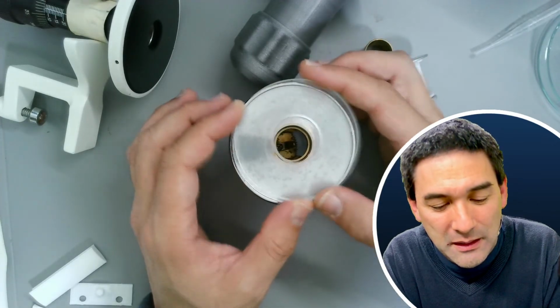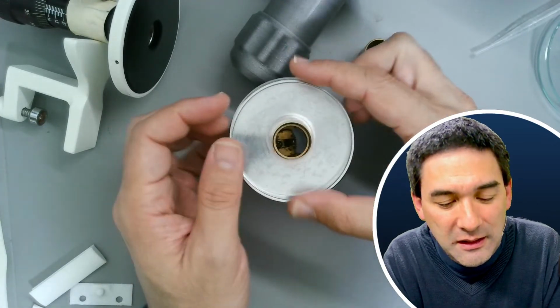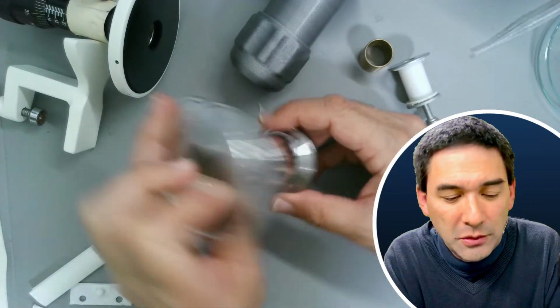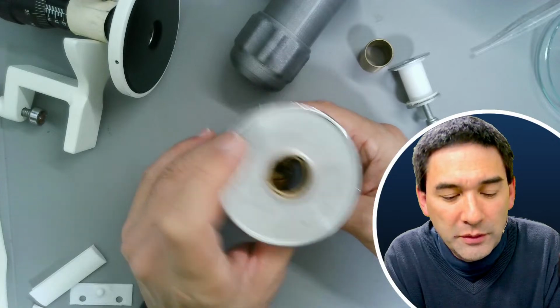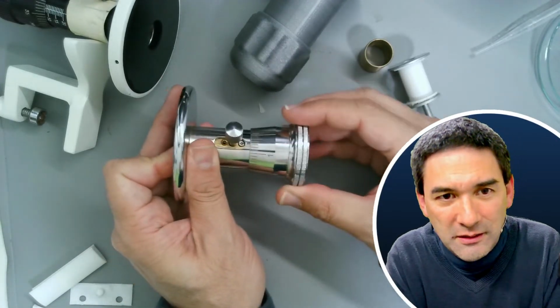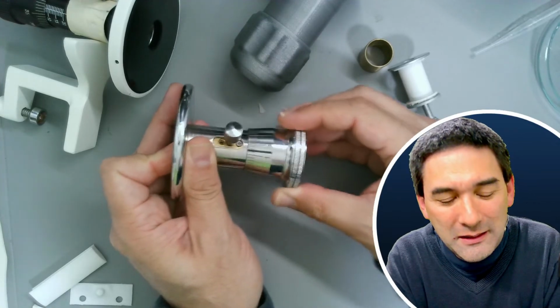But at least it can be taken out. It can be cleaned easily. But one has to be a little bit careful that it doesn't break. And here, that's what can be turned, and this pushes a whole piston in here outwards. But as you can see, it is a bit wobbly.